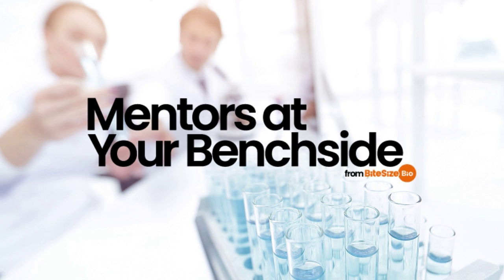Second, ethanol water mixtures don't have additive volumes. That means if you want to make 1 litre of 70% ethanol from absolute ethanol, you can't do it by mixing 700 ml of ethanol and 300 ml of water. The final volume, in this case, would be less than 1 litre. The correct method is to measure 700 ml of ethanol and then bring it to a final volume of 1 litre with water. This is because of so-called vanishing volumes, which are why water and ethanol mixtures don't add together intuitively. And what causes vanishing volumes?